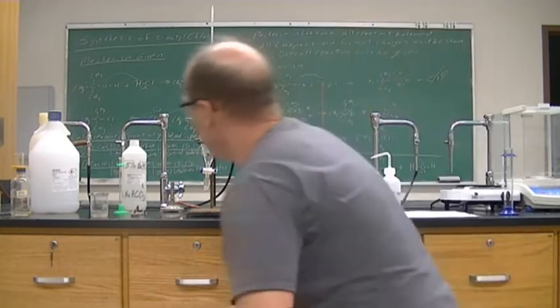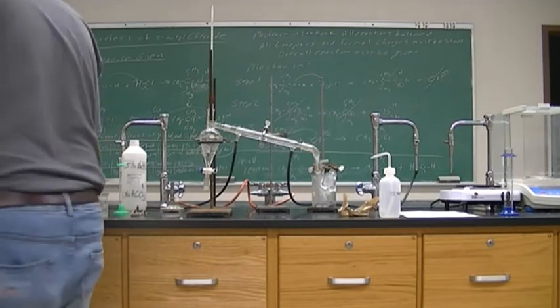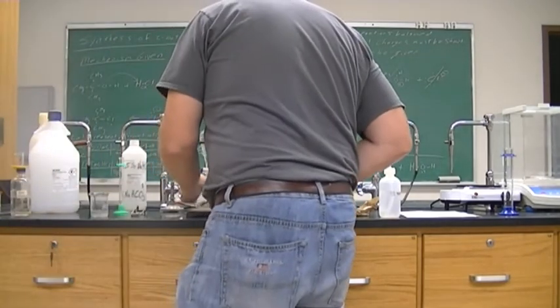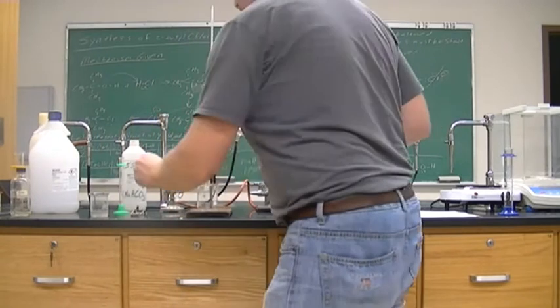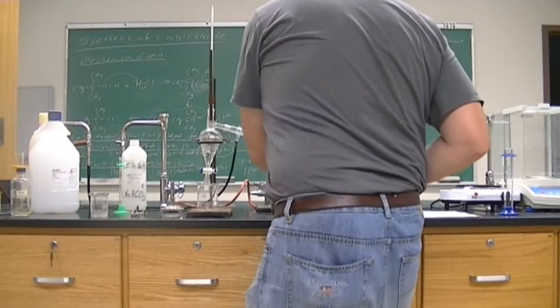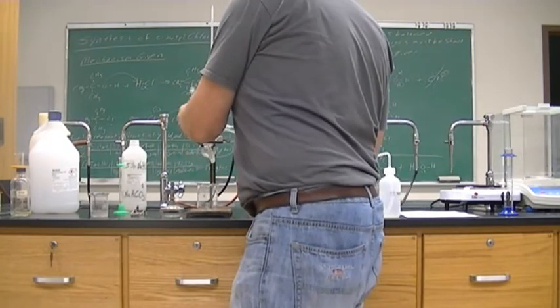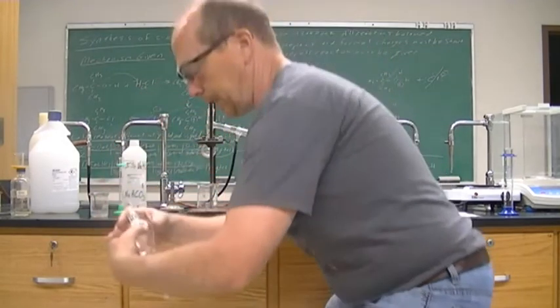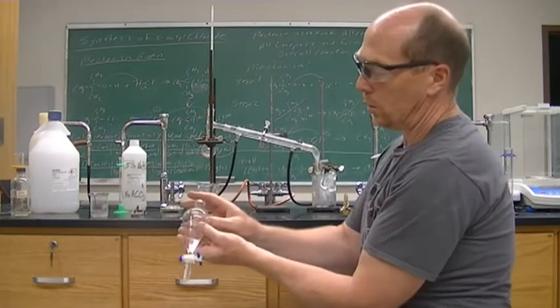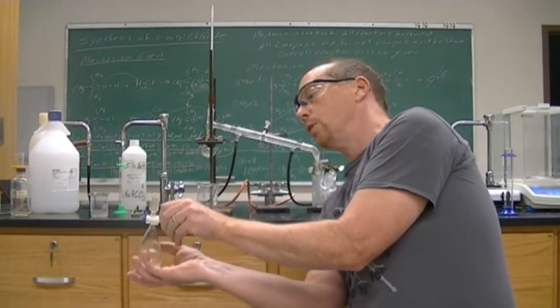I'm going to grab another beaker and drain it into another beaker. Now all these washings can go into the same container. All right, so we'll want to mix it up. All right, so again, gently the first time, and you get the release of pressure.